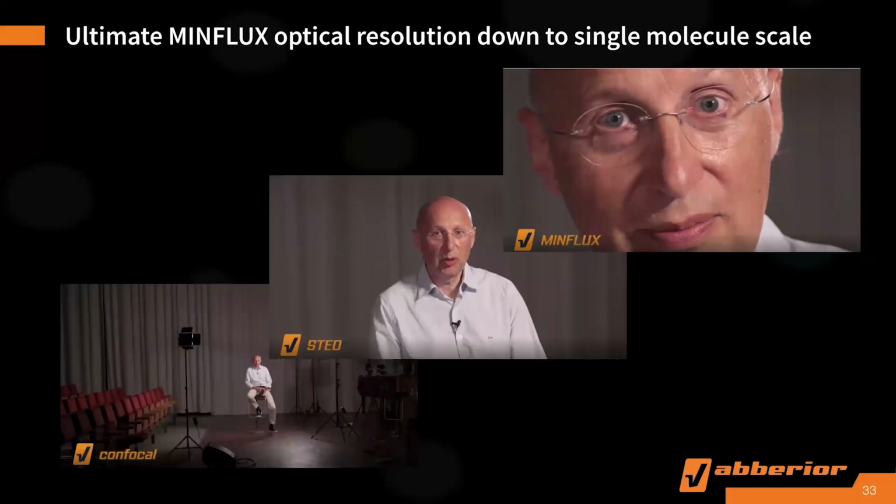So actually, this slide shows you the relationship of the magnification and the resolution. Actually, it is very important. A lot of people are trying to mix these two concepts. These are two different concepts, but they are related to each other. If you have very good magnification but poor resolution, no matter how large you magnify, you cannot see the details.